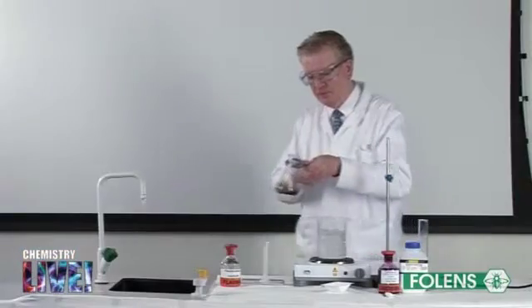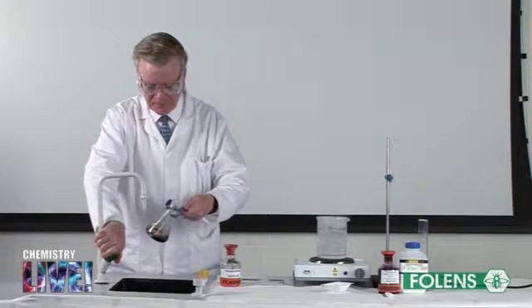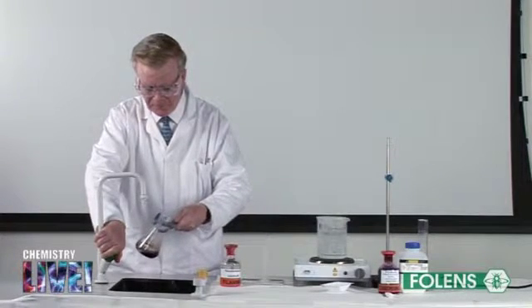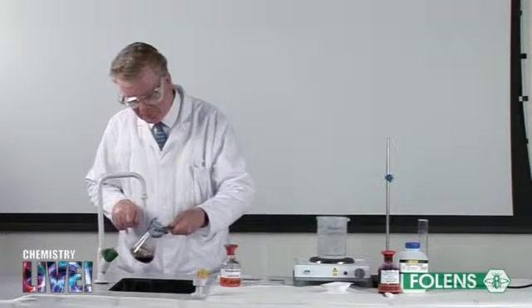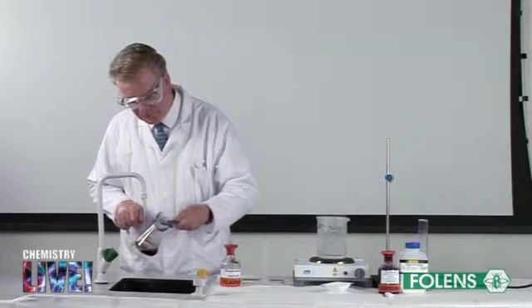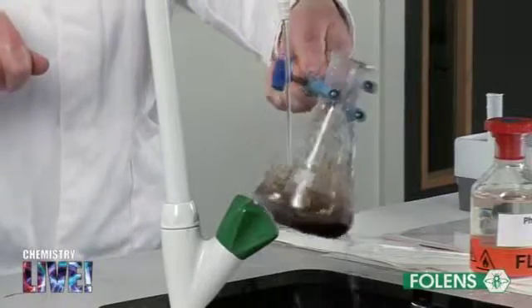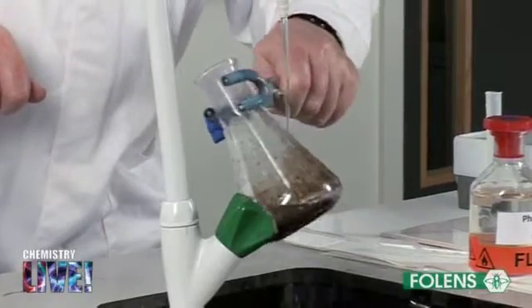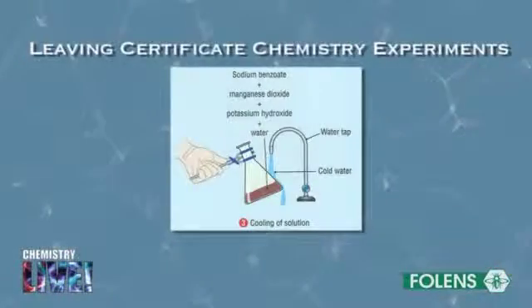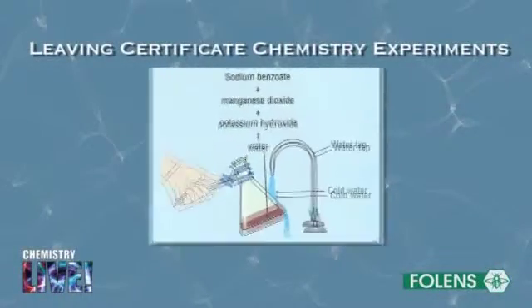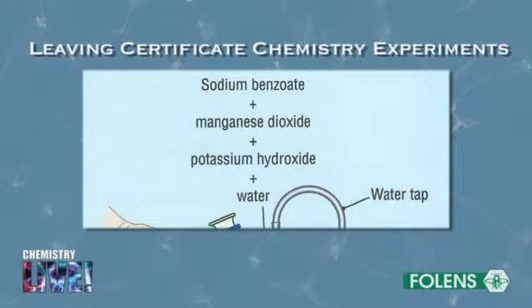A brown precipitate of manganese dioxide, MnO2, is formed, which is not soluble in water. After 20 minutes of heating, the products are cooled by running water from the tap over the outside of the conical flask. The products in the flask consist of sodium benzoate, manganese dioxide, potassium hydroxide, and water. The compound sodium benzoate is produced as an intermediate in this reaction and will be converted to benzoic acid in the next stage.